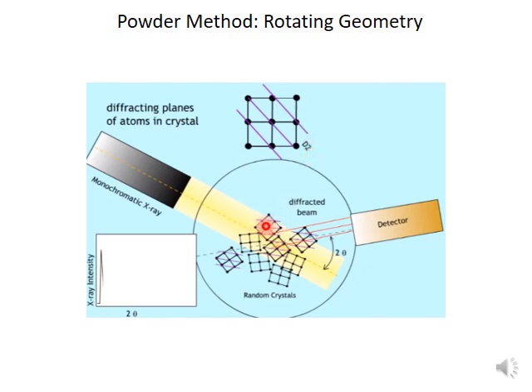These are highlighted, the crystallites which produce the diffraction from this particular set of peaks are highlighted here. So at this particular 2 theta, where this condition is satisfied for this particular peak, you would get a corresponding peak for that in your diffraction data.